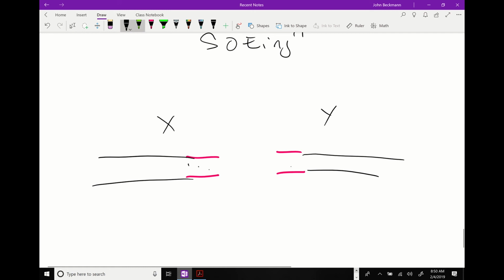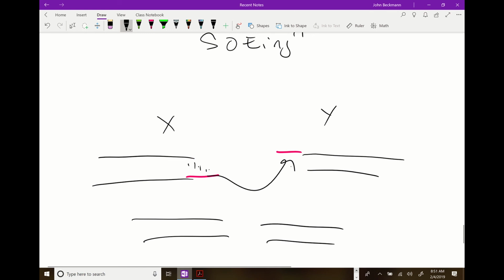And then you add exonuclease, which comes in on the end and degrades that and degrades that. Now all of a sudden this finds that and they link together. So it's a way to fuse PCR products by using an exonuclease. An exonuclease is something that comes in on the end and degrades DNA. Okay, so that's very, very brief.